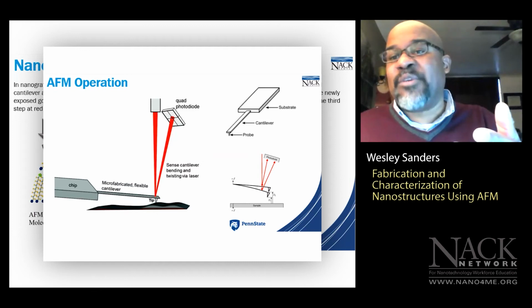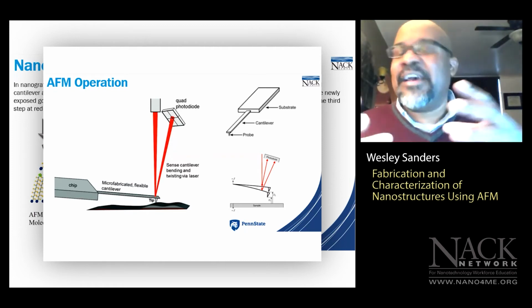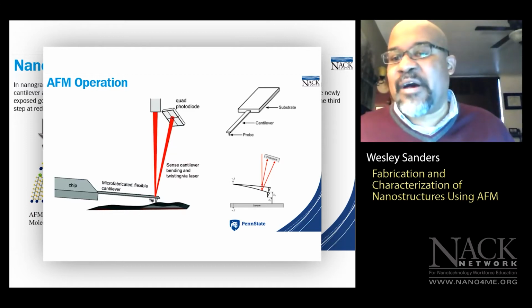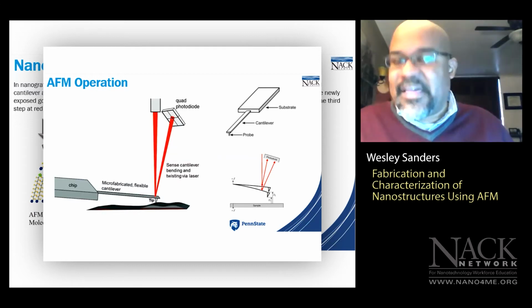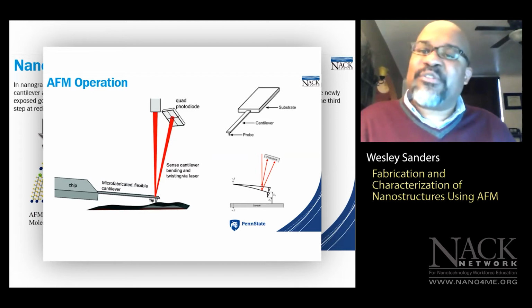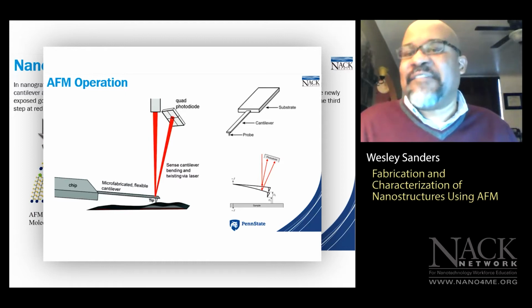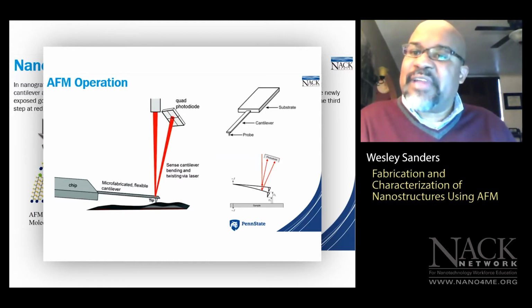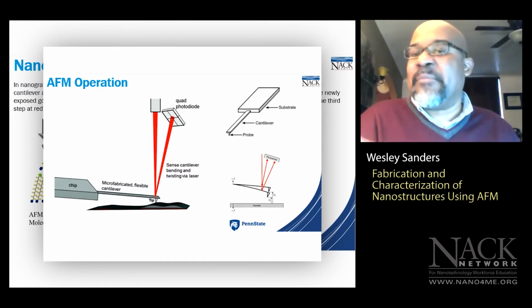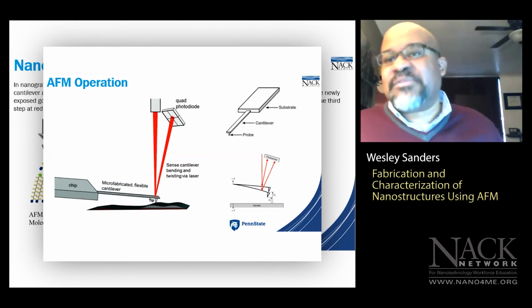And also, when you use a sample scanning stage, you limit the size of sample you can use for that particular model. But that goes back to what I was saying about the piezoelectric materials. Piezoelectric materials have step sizes that are less than a nanometer, like 1/10 of a nanometer, right? So these piezoelectric scanners are able to move the tip in sub-nanometer or angstrom increments, right? So that's why the scan.